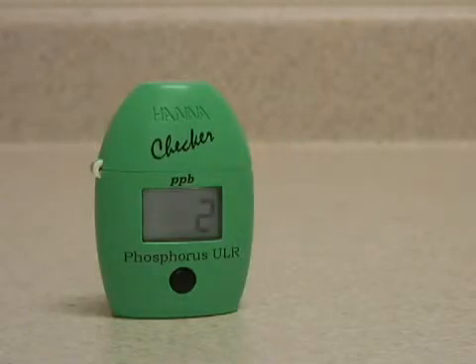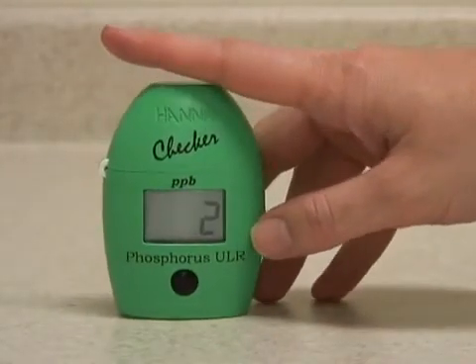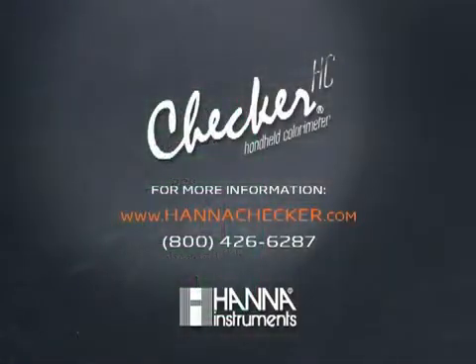The three minutes are up, and the meter has sampled the phosphorus and displayed the reading.